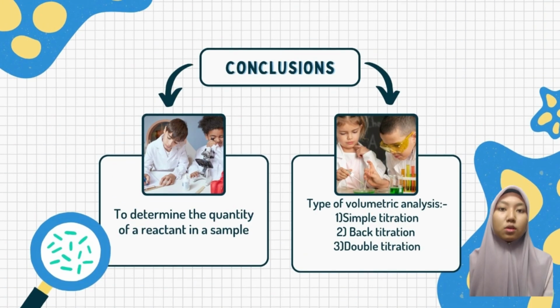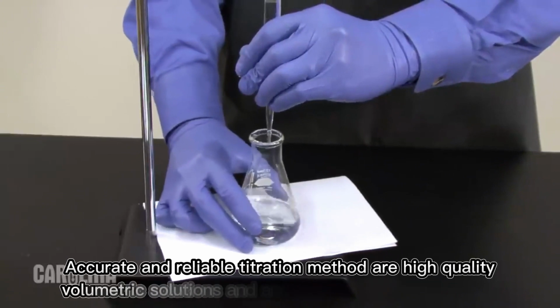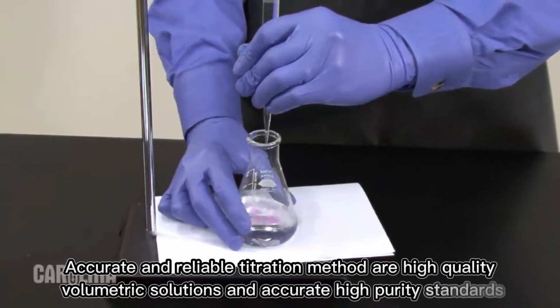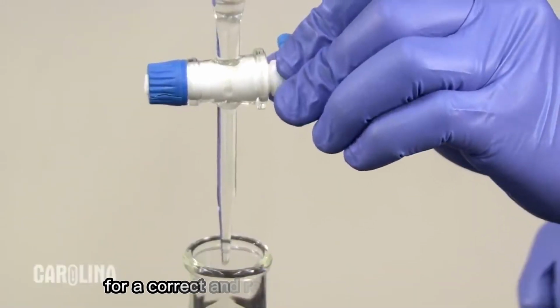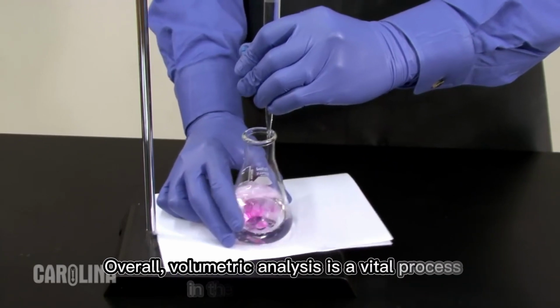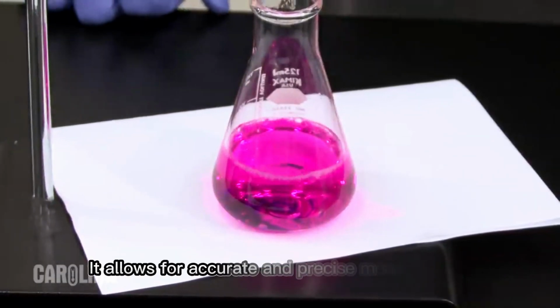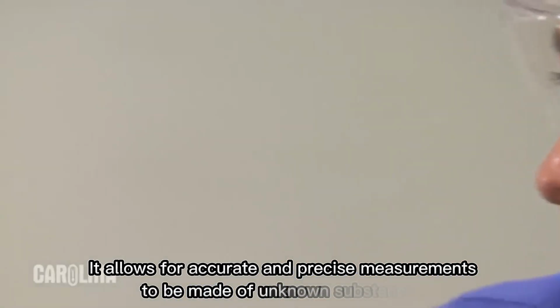So now, let's jump to the conclusion. The first one, volumetric analysis is used to determine the quantity of a reactant in a sample. Then there are three types of volumetric analysis: simple titration, back titration, and double titration. Accurate and reliable titration methods need high-quality volumetric solutions and accurate, high-purity standards for a correct and reliable titer determination. Overall, volumetric analysis is a vital process in the field of chemistry. It allows for accurate and precise measurements to be made of unknown substances.